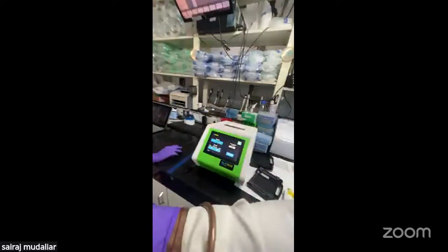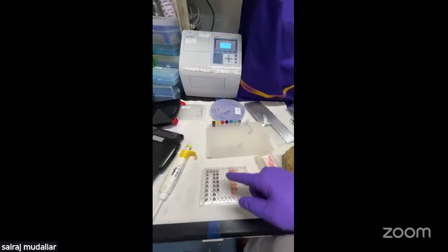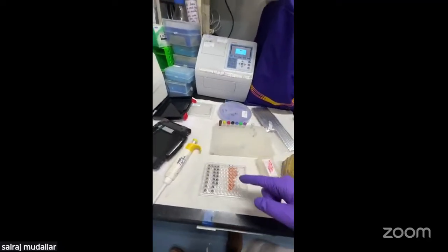So this is how the plate layout generally looks. You can quantify your protein samples with the Bradford assay using the standard BSA samples. This is on the basis of the coloring or the intensities, as things change. Okay, so you can easily quantify.